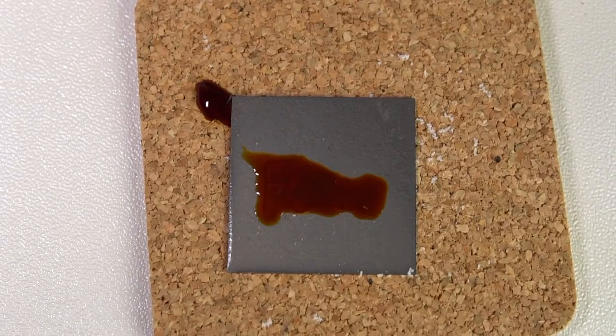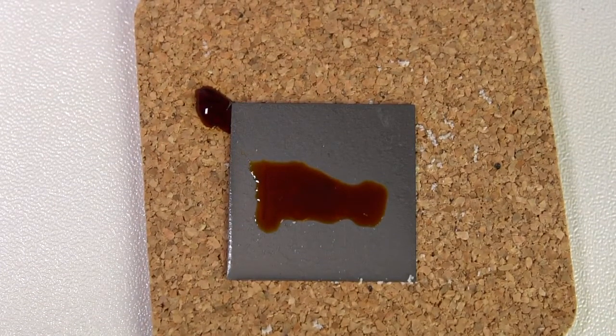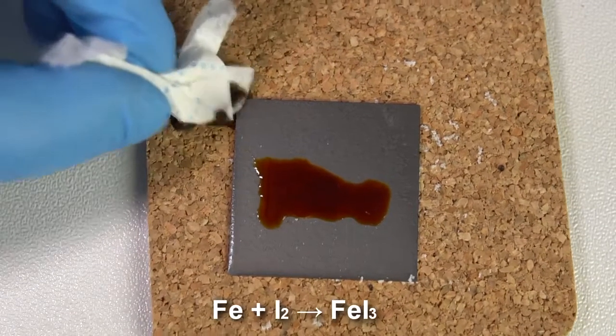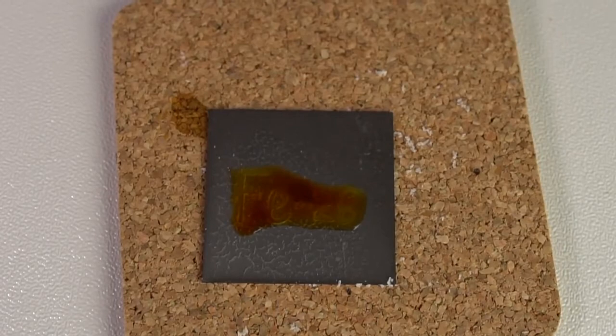Leave the plate with iodine for 20 minutes. During this time, iodine will be taking electrons from the unprotected areas of the iron plate, oxidizing them to iron iodide, which is well soluble in water.